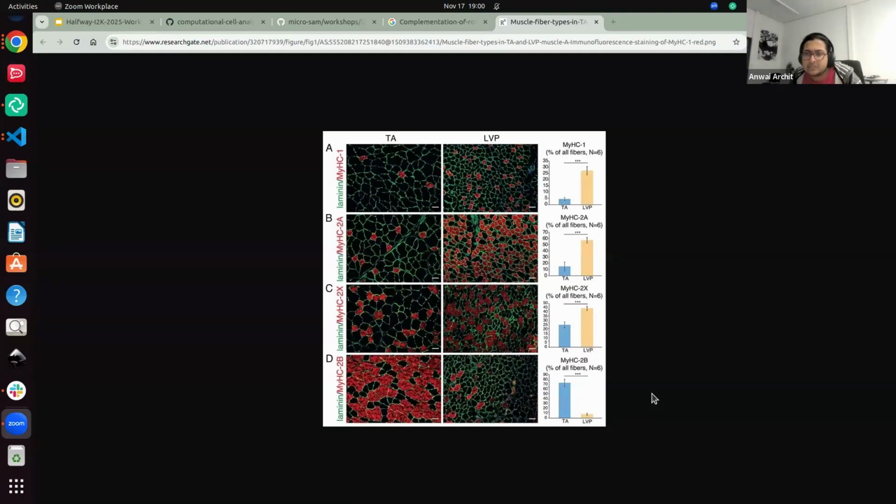2D, but like 3 GB. Jesus, what's the bit depth? Are we playing gigapixel resolution here? What are we playing with? Okay, what's the bit depth? That would also be a big influence. Do you know if it's 16-bit, 32-bit, 64-bit? What are you storing it as? Yeah, that's what explains the 3 GB.